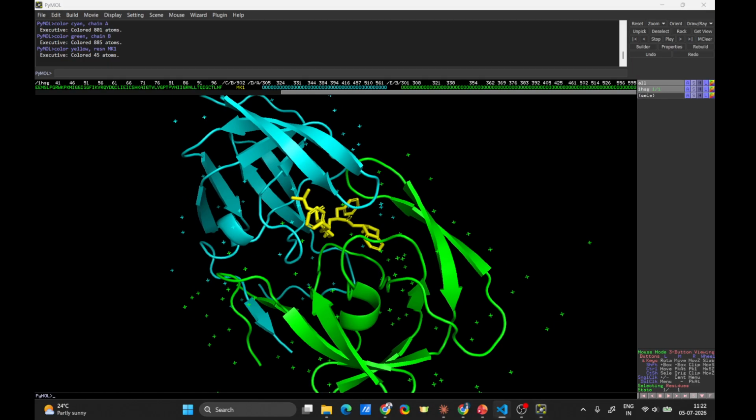It's really satisfying, I must say that. Next is if you want to color different residues, right? So for that one, let me type it down. I want to color, and then I need to provide a color, which in this case, let's do magenta, and then comma.